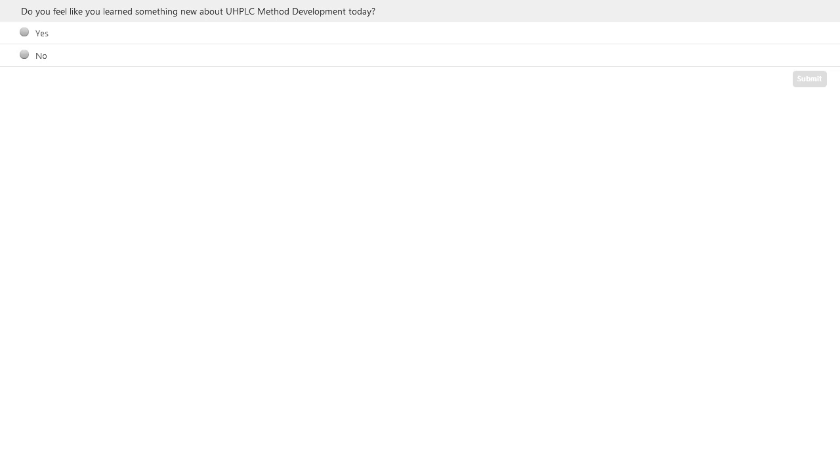retention time should remain consistent, and that's really where I think the USP has been coming from. If we keep the same length to particle size ratio, then all of our peaks should be moving in the same way. We are achieving the same separation, just in a faster time. If you start changing other things in the method, then obviously your relative retentions can move around. But they should, in theory, be the same because you're getting the same separation.